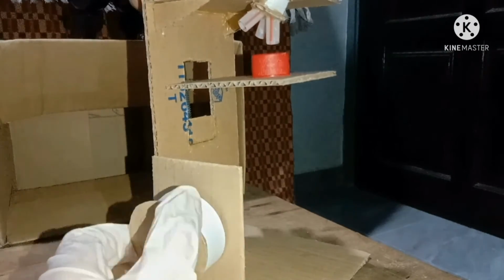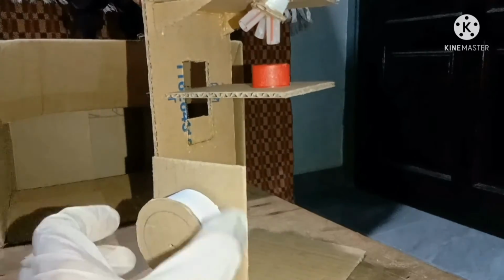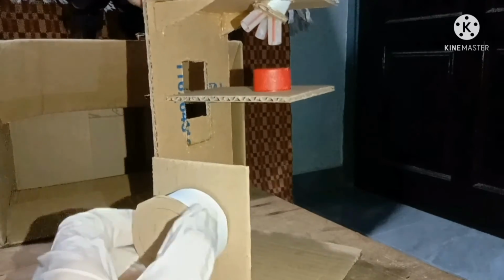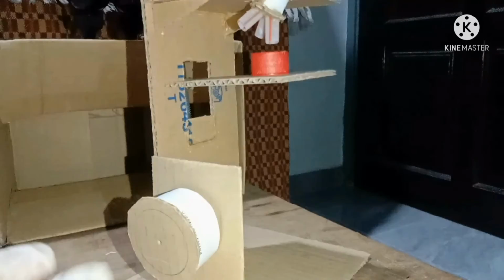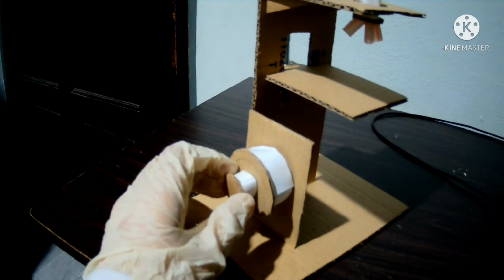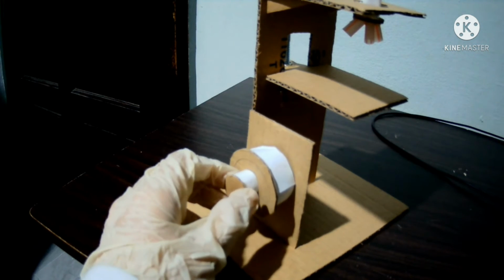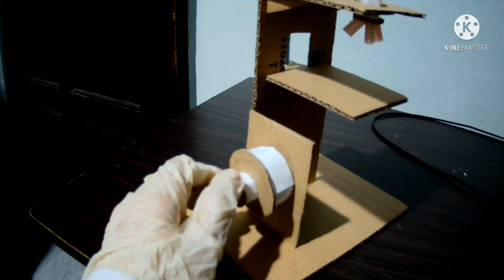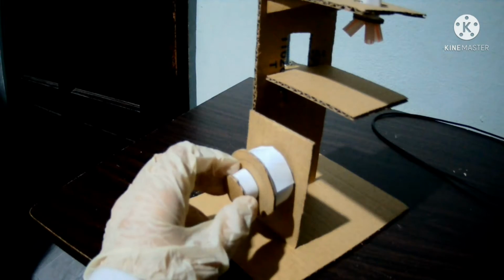For this stage, we move the stage down a little bit for the computer to read or get the image clear at the software. To make the image clearer to see, we adjust the fine focus lens.